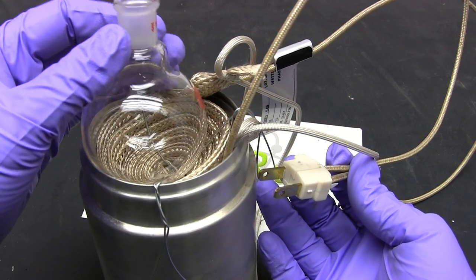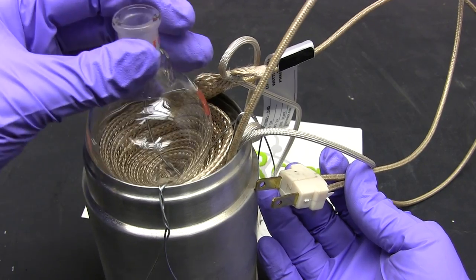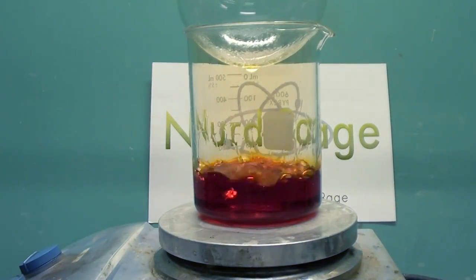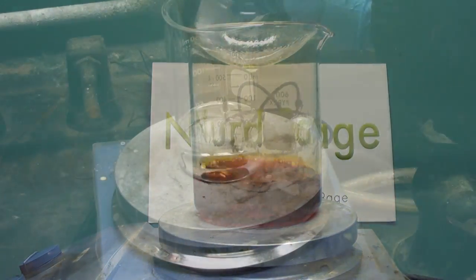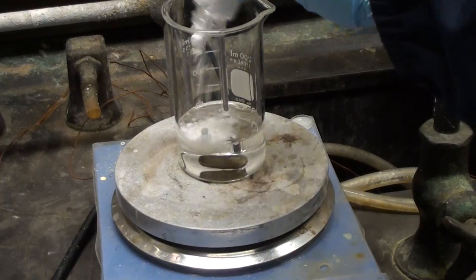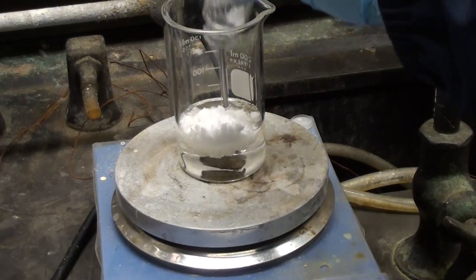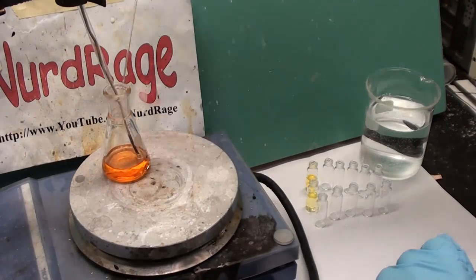Greetings fellow nerds. In this video we're going to make a heating mantle. Now hot plate stirrers are great and for most purposes you'll never need anything more. But their maximum temperature usually tops out at about 300 to 400 degrees celsius.